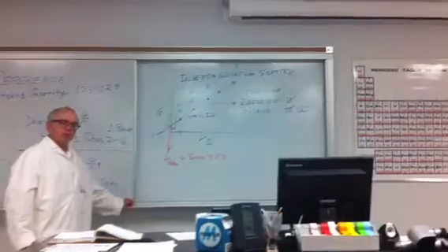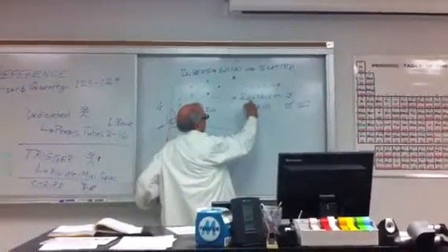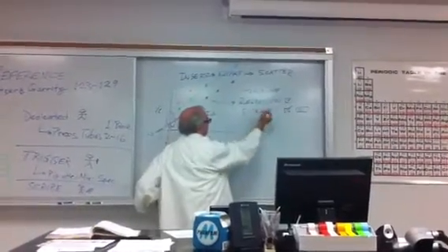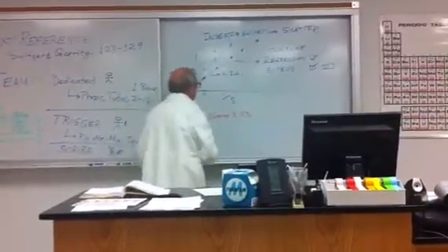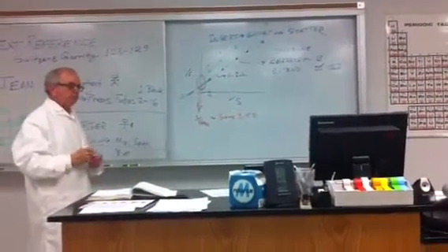Plus or minus 15% of what? Of the regression numbers. The intercept on the regression data. So you have to show that. That's why it says, check that off. Say, yeah, show the regression. Extend, yes, extend out here so we can see it. All right? Am I making myself very clear here?